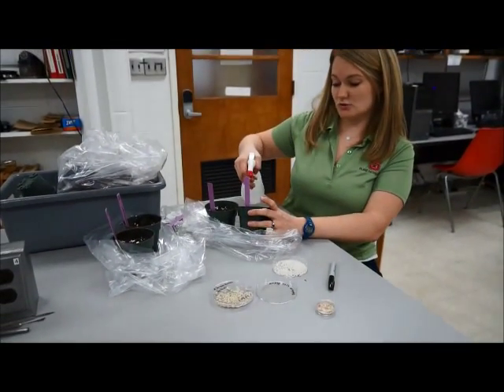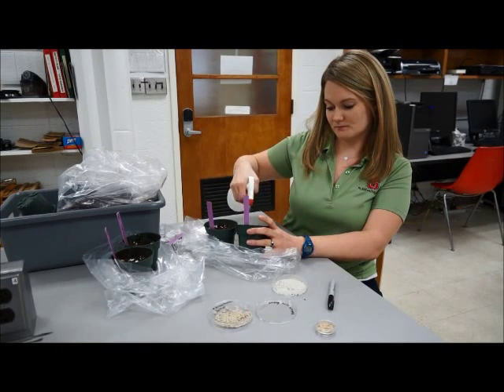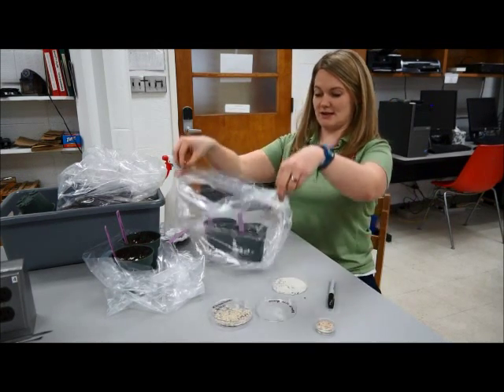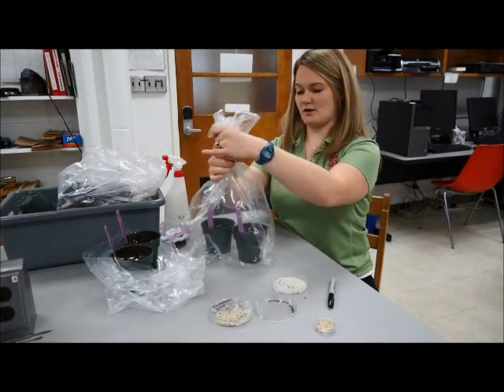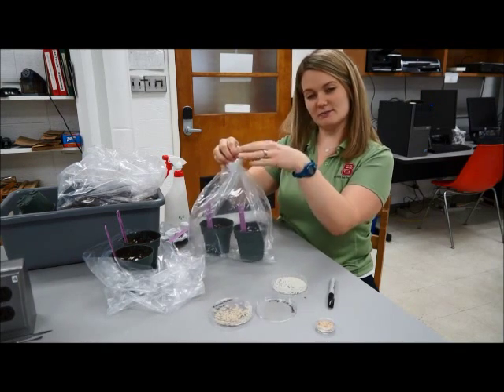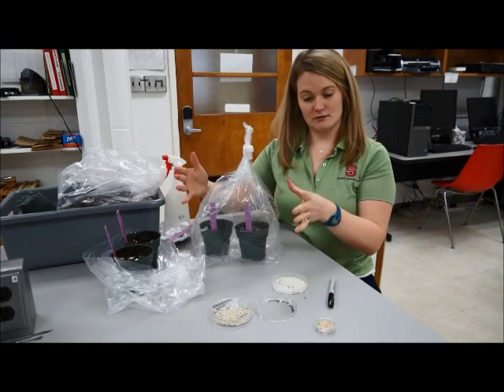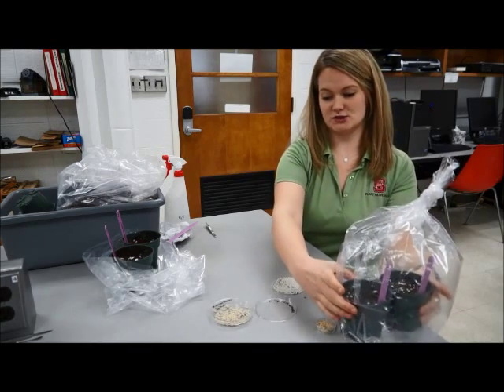We're going to water in the rice grains and seeds so the seeds have enough water to germinate, and so anything on those sterile seeds will also have the water they need. Then we tie the bag, leaving some headroom, to keep the humidity high inside. Our disease as well as our plants need that high humidity. We'll set these to the side.